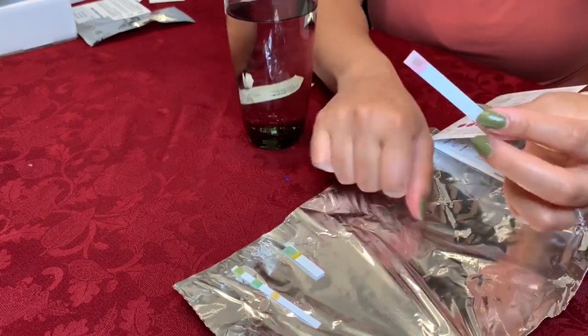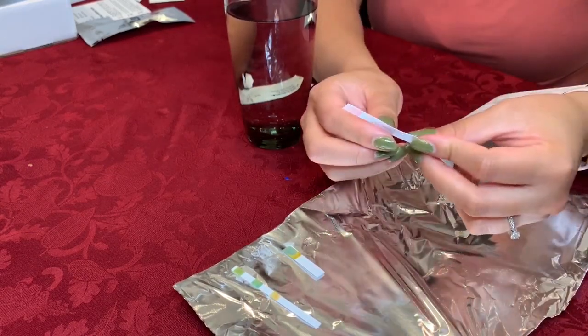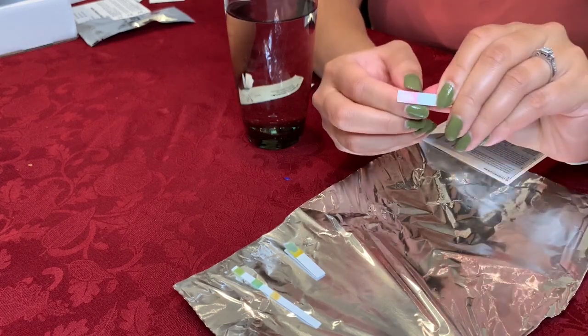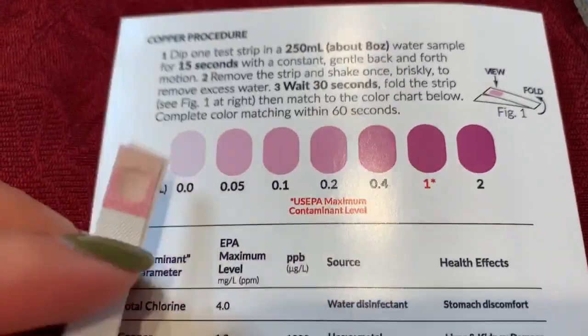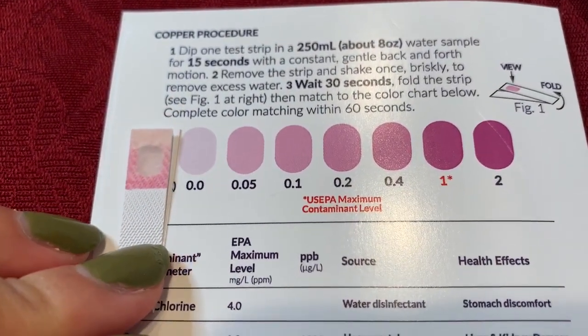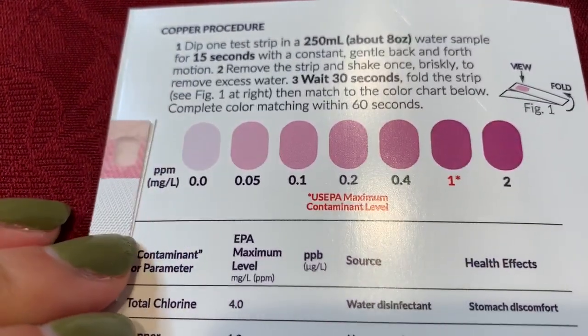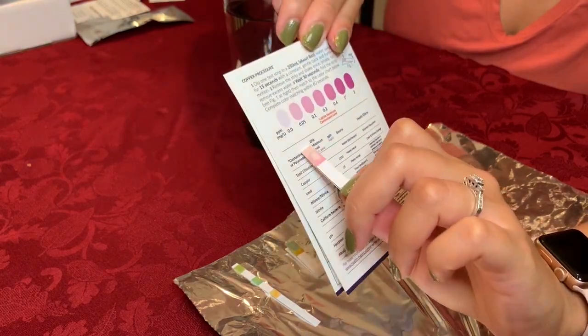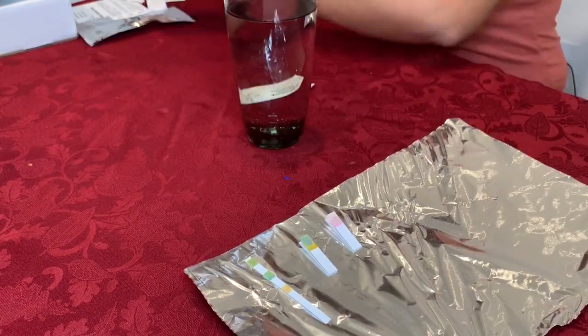So now it's been 30 seconds. All I have to do is fold the strip so that this is facing in the back. Copper test — zero. I would say there's about zero copper present in my water, which is good.